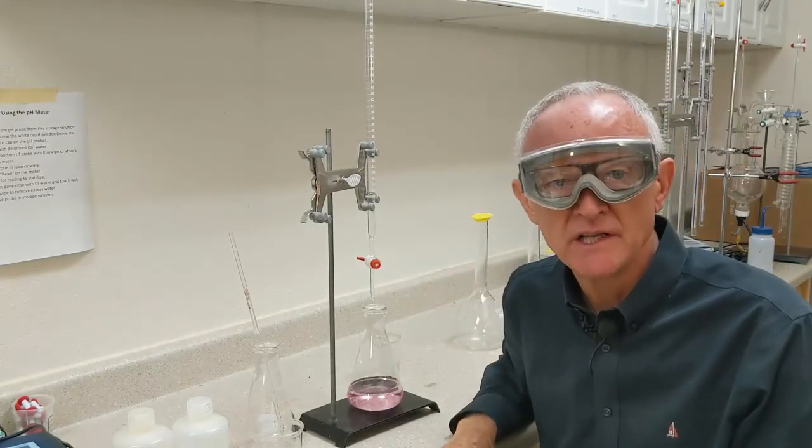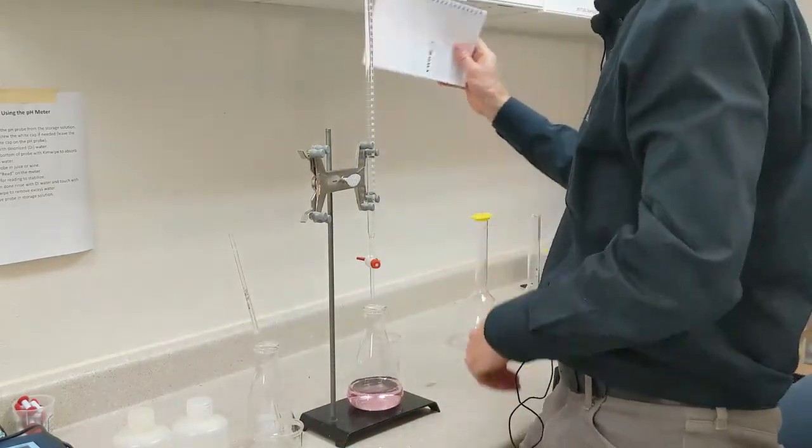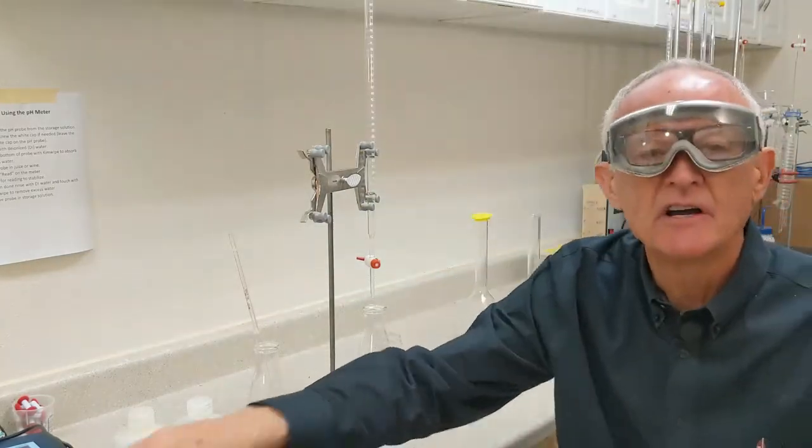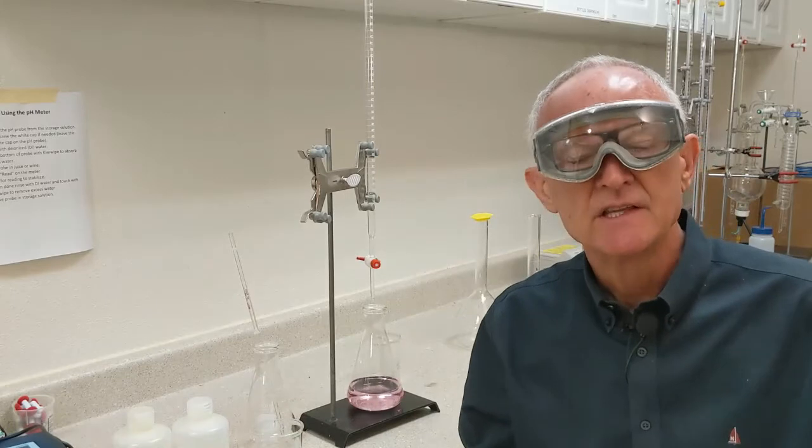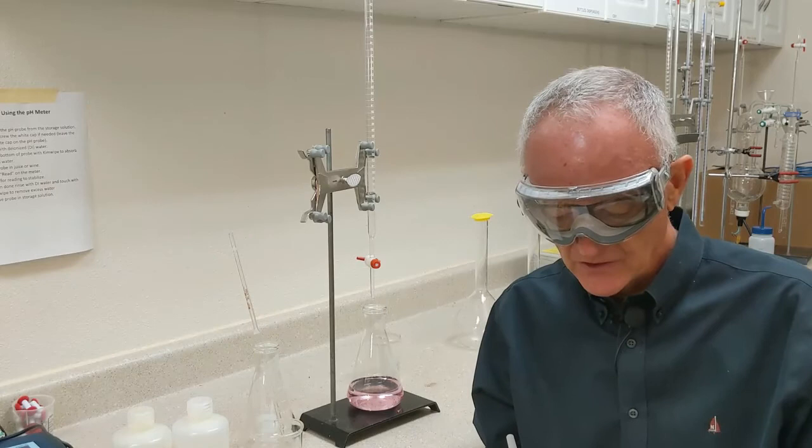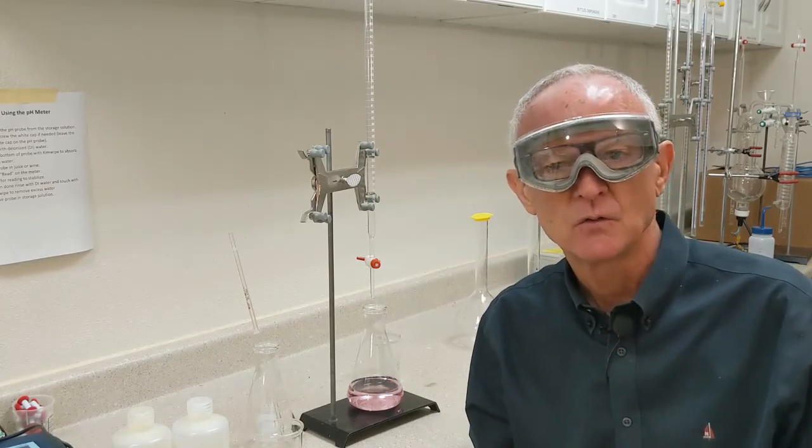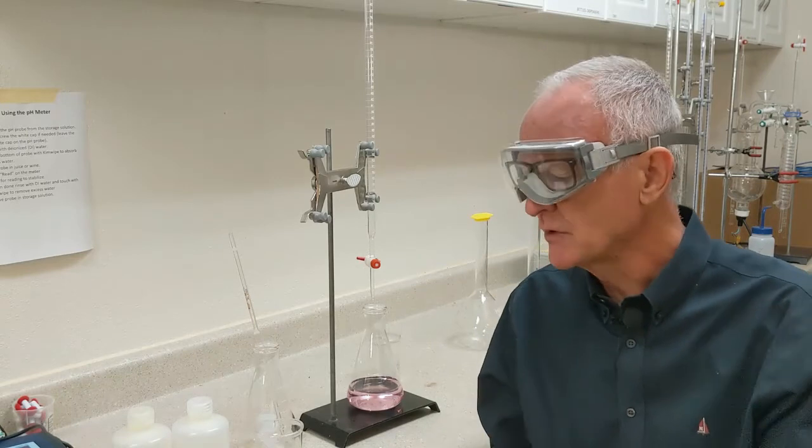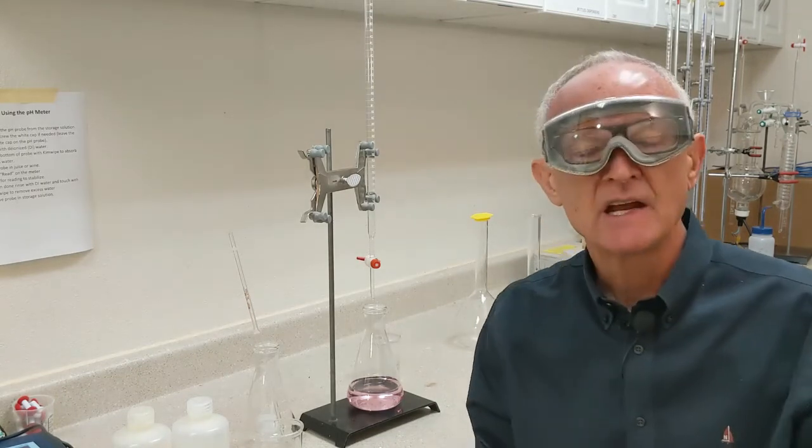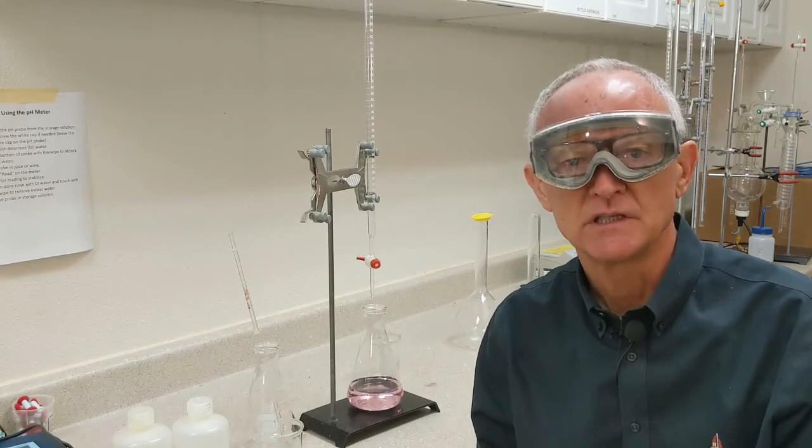My ending volume is exactly 14. In this second titration, I started at 10.3 mils. I ended at 14. So I used 3.7 milliliters. 14 minus 10.3. 3.7 milliliters. And I will use that in the calculation of titratable acidity.